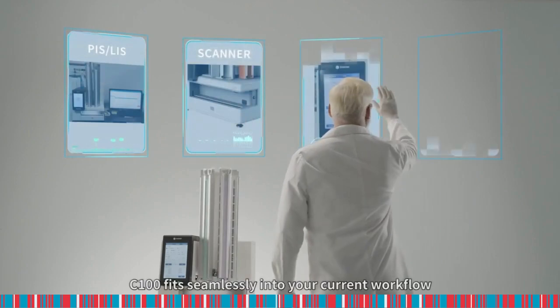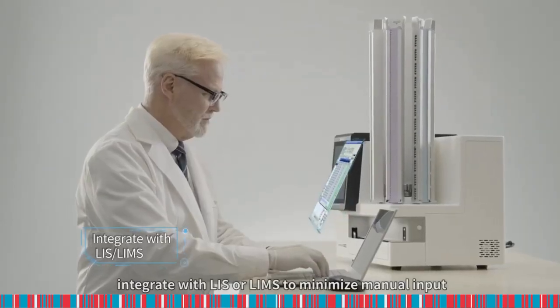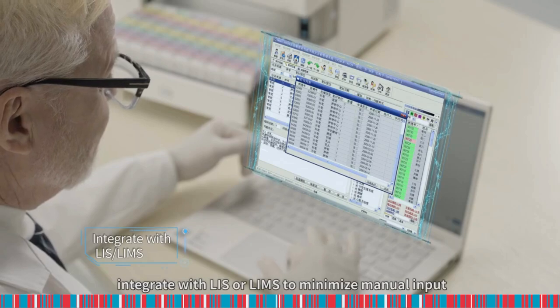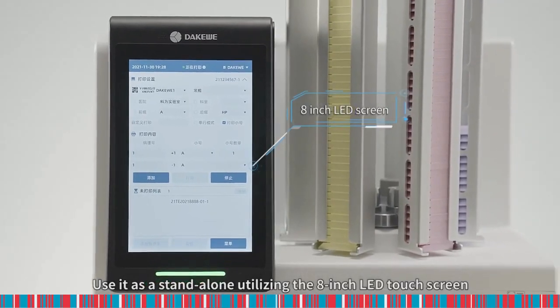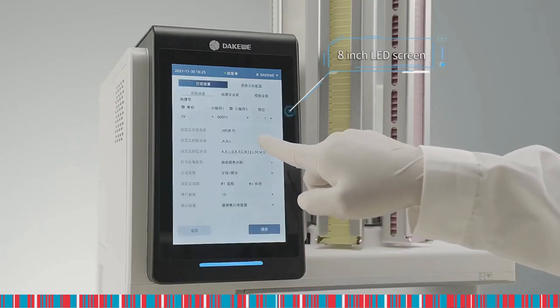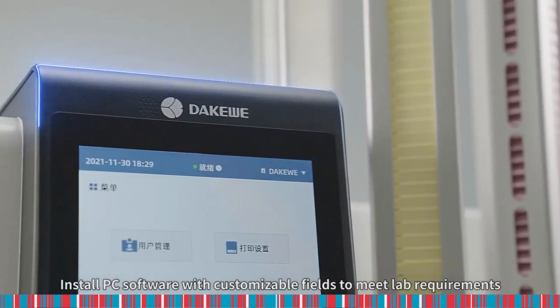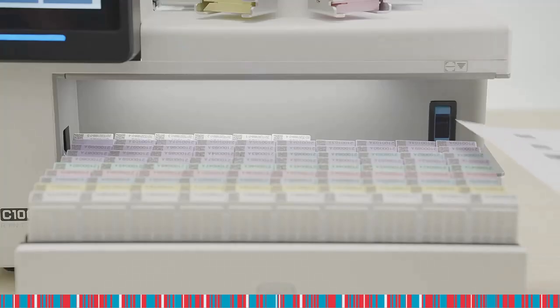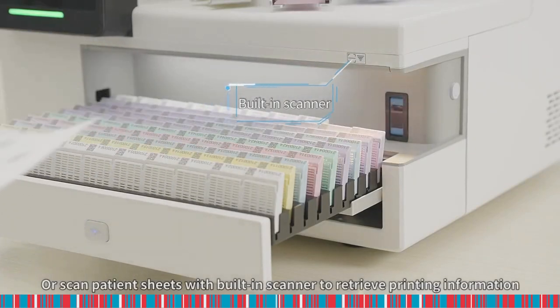C100 fits seamlessly into your current workflow. Integrate with LIS or LIMS to minimize manual input. Use it as a standalone utilizing the 8-inch LED touchscreen. Install PC software with customizable fields to meet lab requirements. Or scan patient sheets with built-in scanner to retrieve printing information.